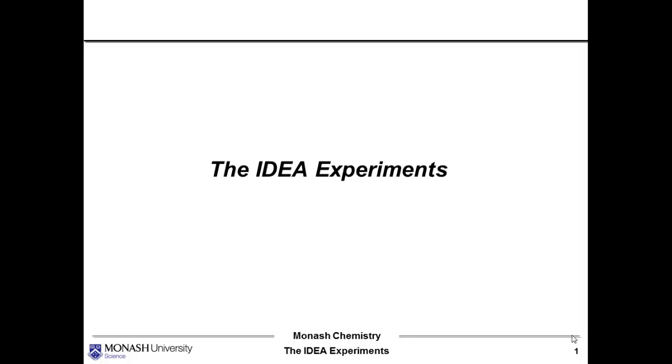The following pre-lab video corresponds to one of Monash Science's idea experiments. In this case, it's in the School of Chemistry, and we're going to be focusing on calorimetry. Idea experiments are a bit different to the usual kind of undergraduate experiment.